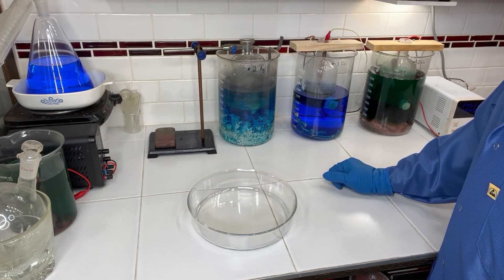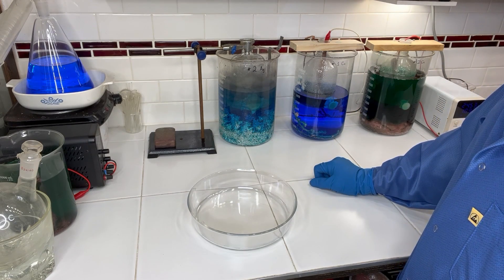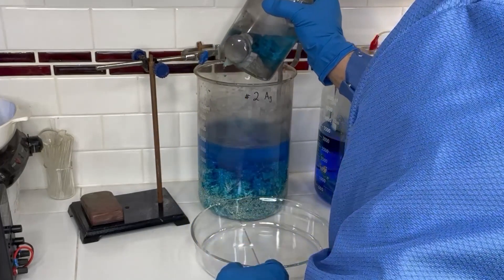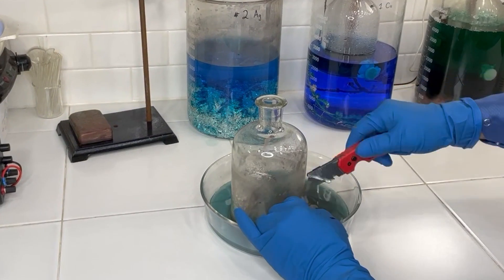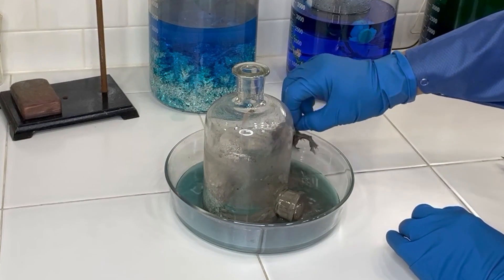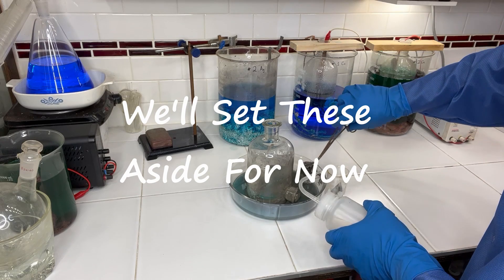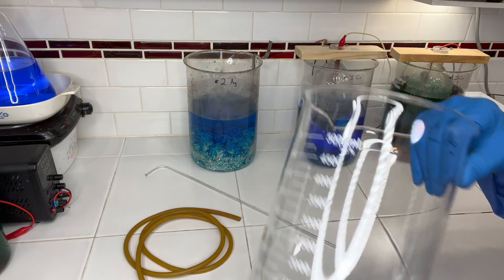What we need to do now is get this aspirator bottle out of here and get this cell cleaned up, taken apart, broken down, and get a test on the purity of this silver. We're going to siphon out the silver nitrate solution that's in the number two silver cell. I'm just going to set up another five liter beaker down below.